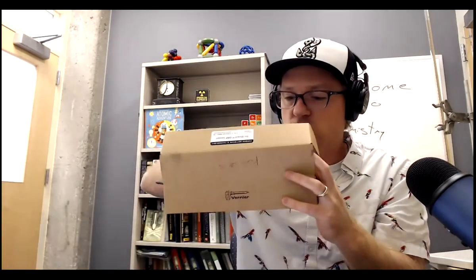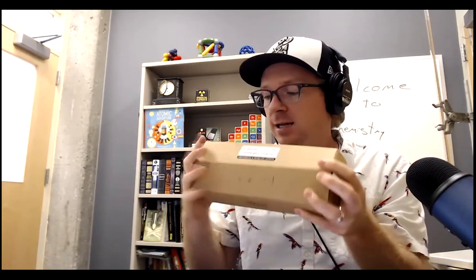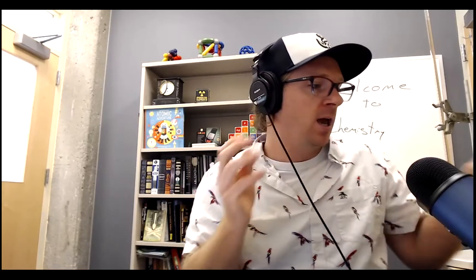You probably have questions, and that'll be fine. Things might not work out the way that you're supposed to. Hopefully the instructions get most of us there. Again, just turn it on, connect it, switch to events with entry, and hit play, then hit keep, and you're collecting data.